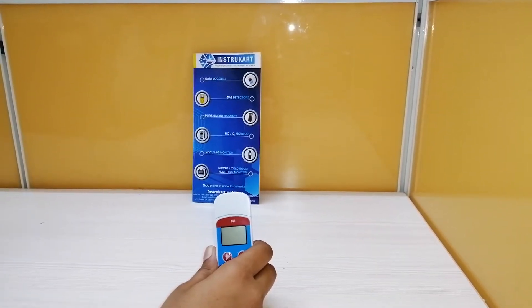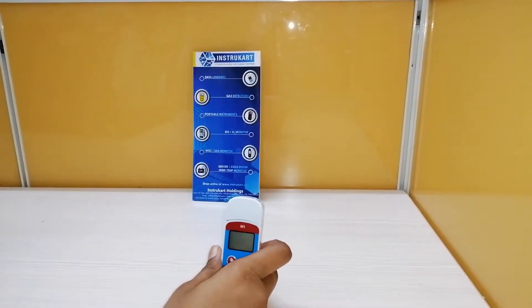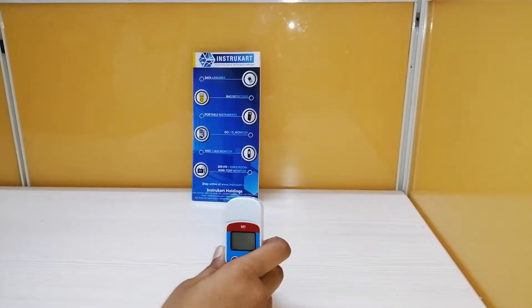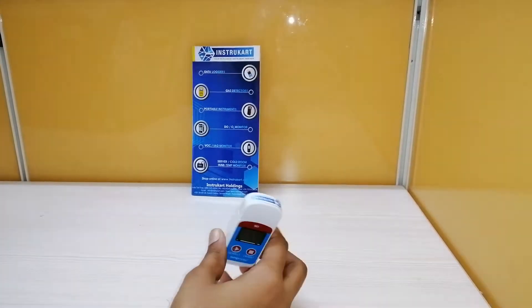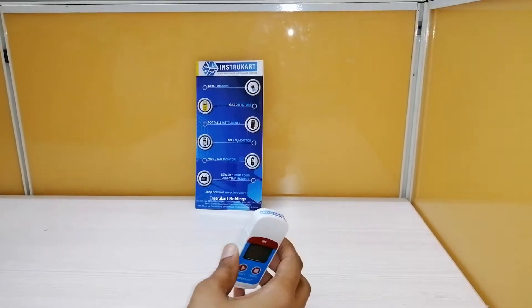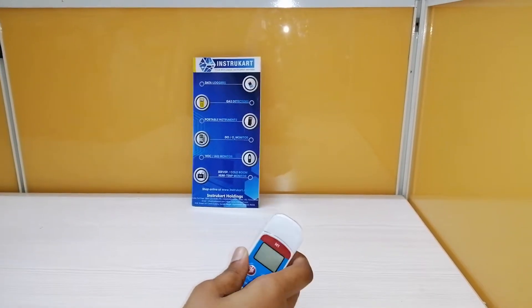and other products during transportation or storage. This data logger has main features: it is a multiple-use device, it automatically generates a PDF report, it has a high waterproof level rated IP67, and the battery is an internal CR2032 which is an exchangeable battery.